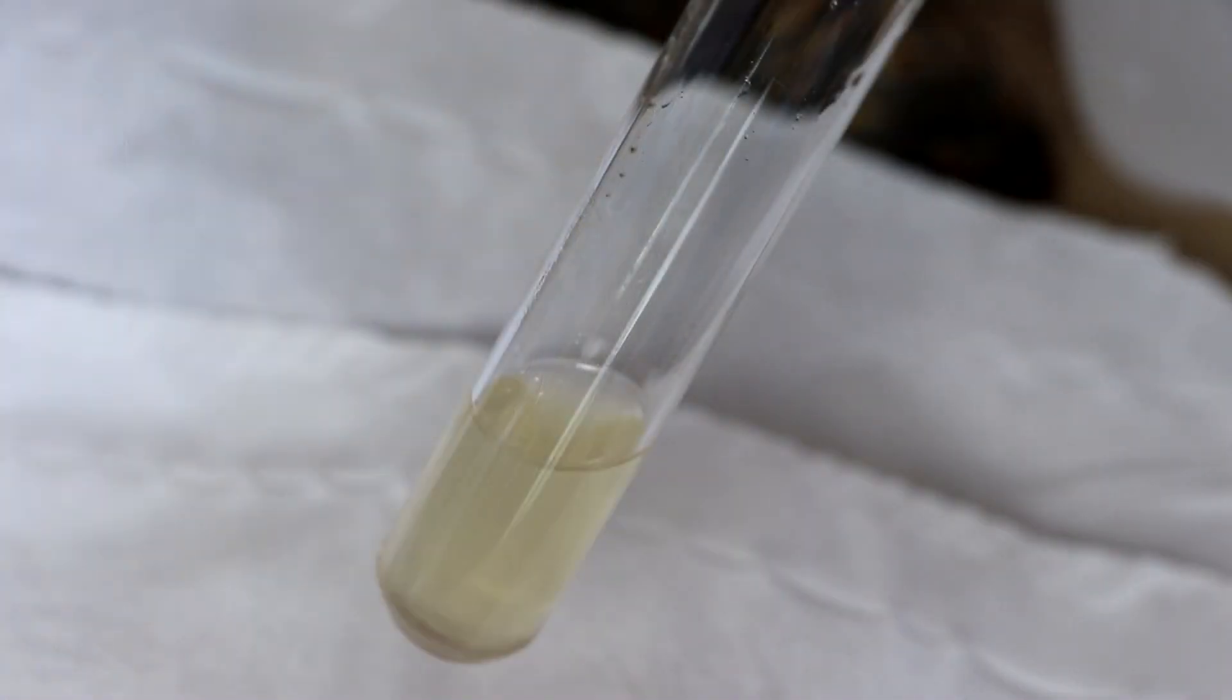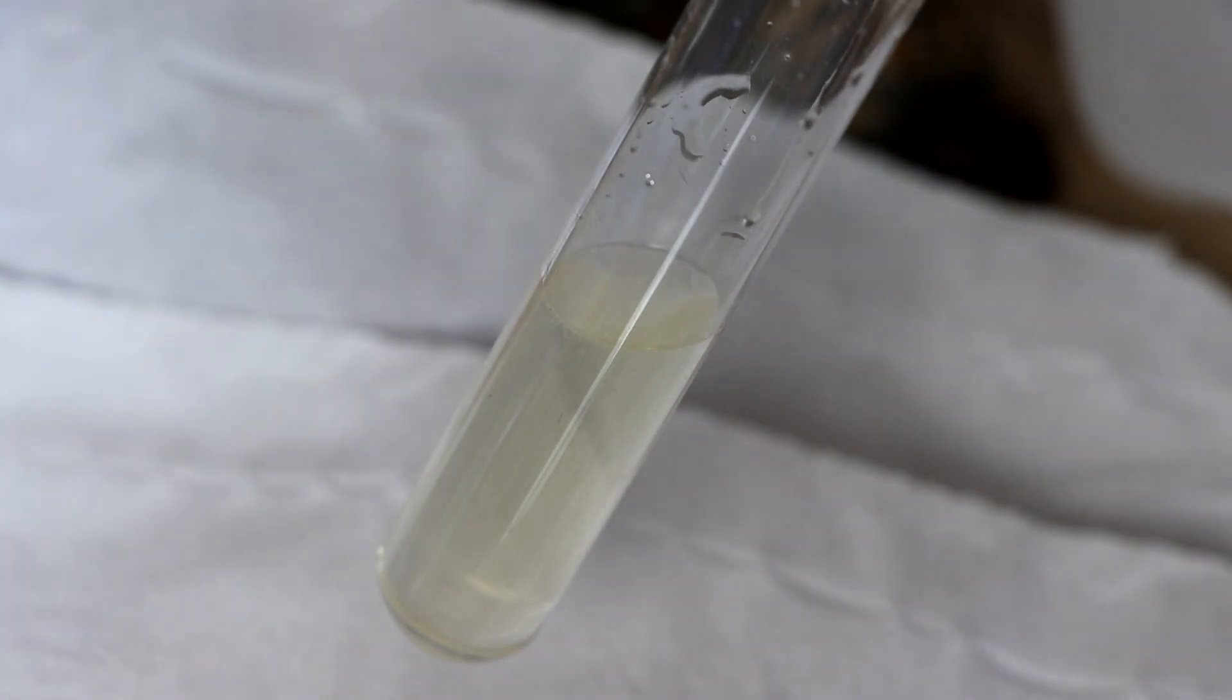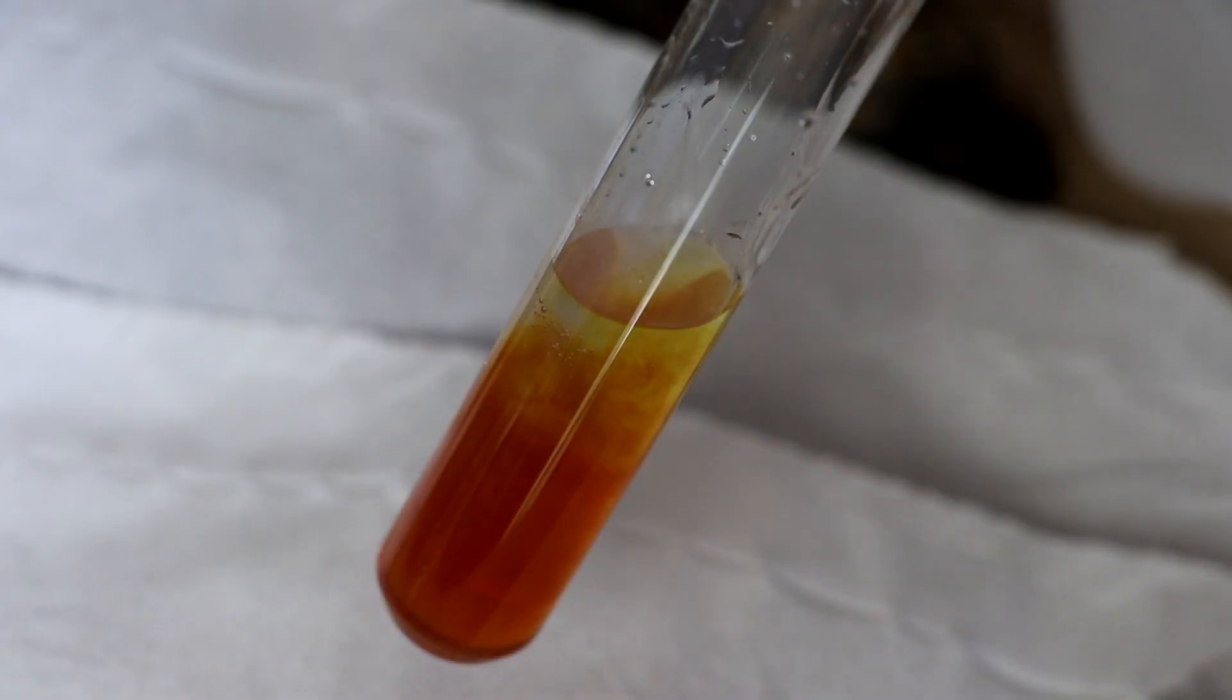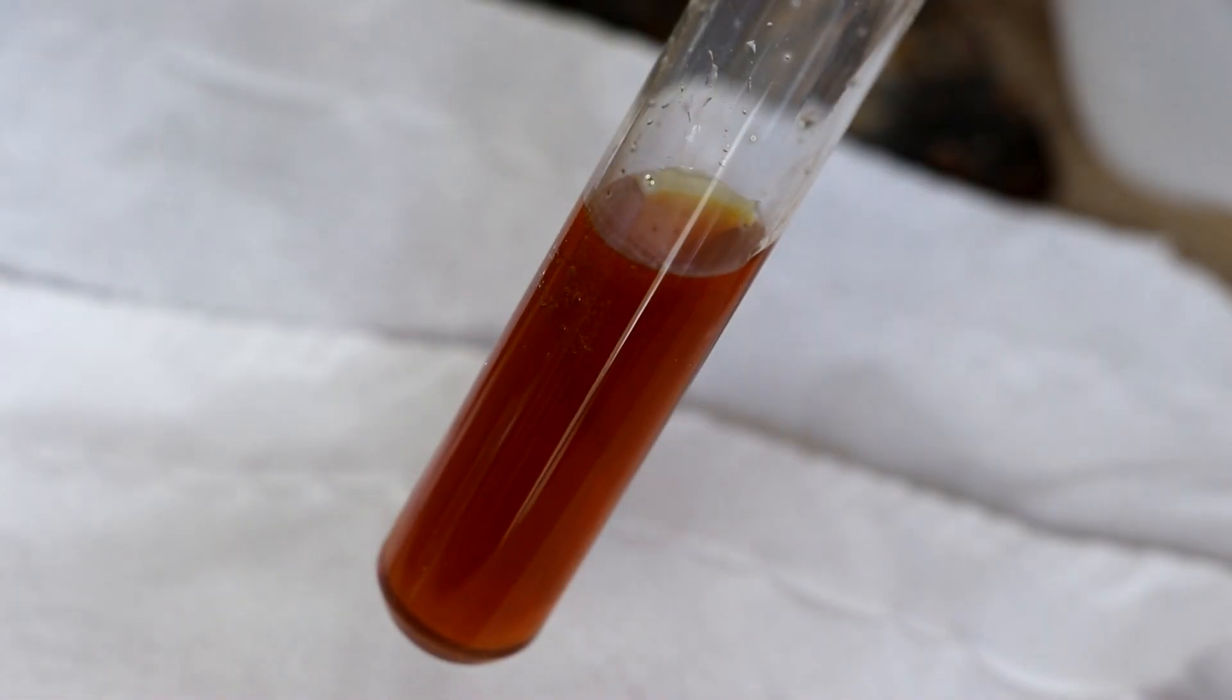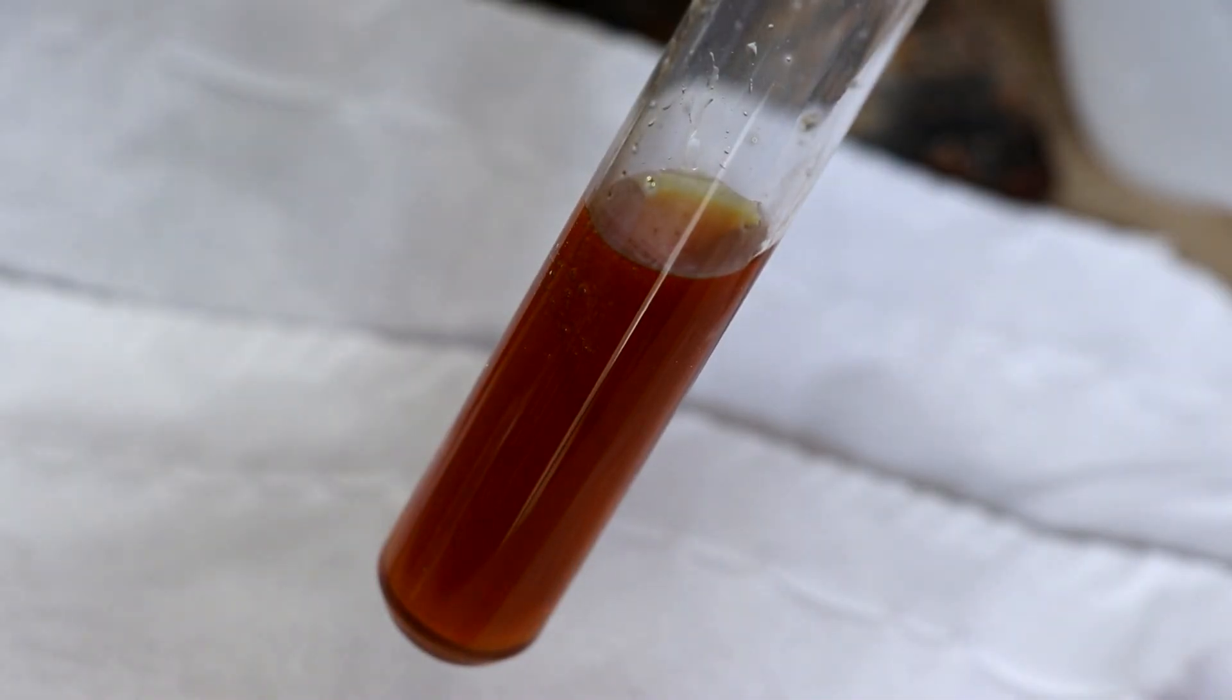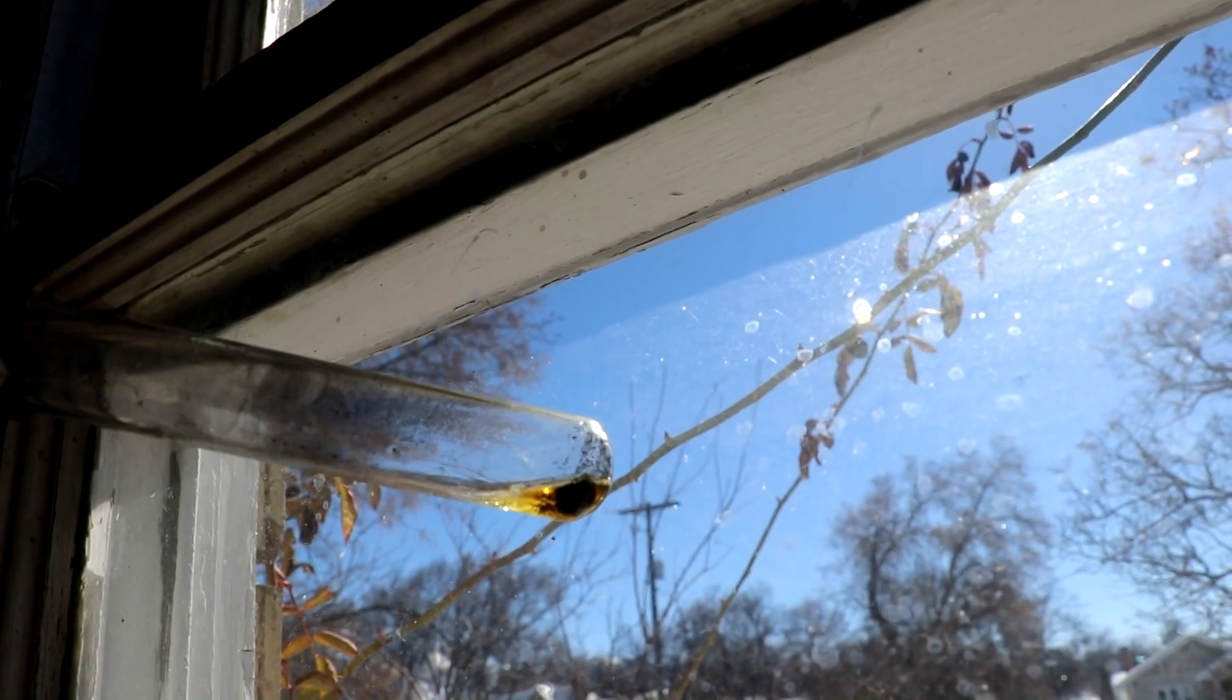So now I'm going to acidify the solution with a little bit of hydrochloric acid. Okay. And now I'm going to add in some hydrogen peroxide. There we go. Elemental iodine. So I'll let this finish reacting. We'll go decant off the liquid and we'll go look at the iodine in the sunlight. So there it is.